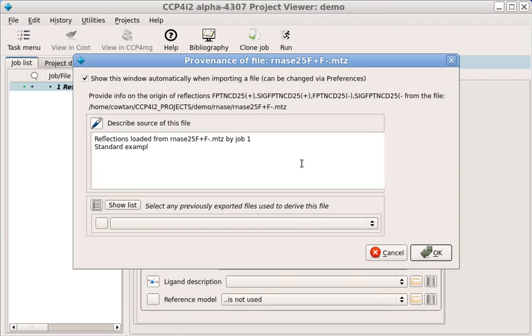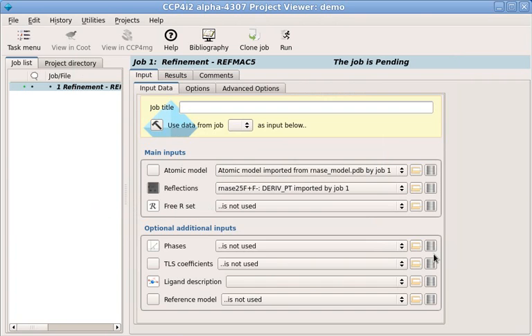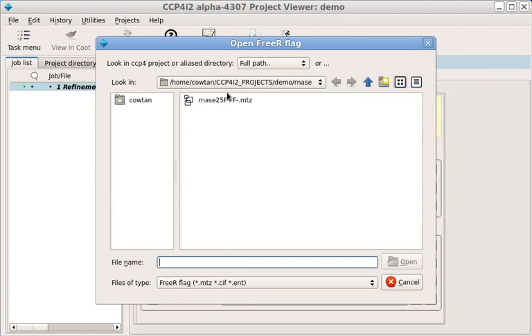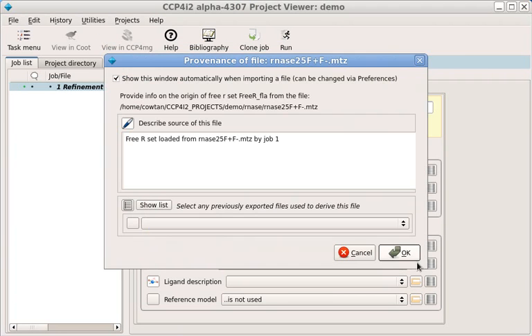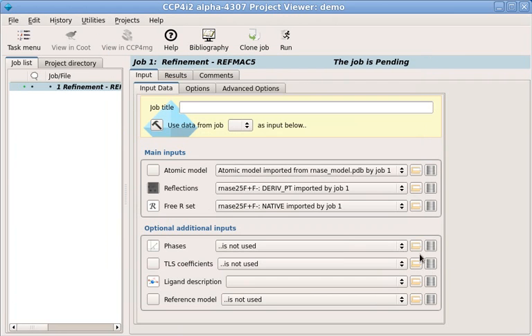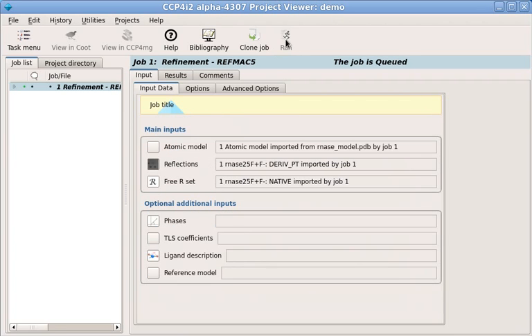When importing a file, we're also asked to say something about where it came from. This will help you with your data management. Finally, we'll select a set of FreeR reflections in the same way. Now we click Run.